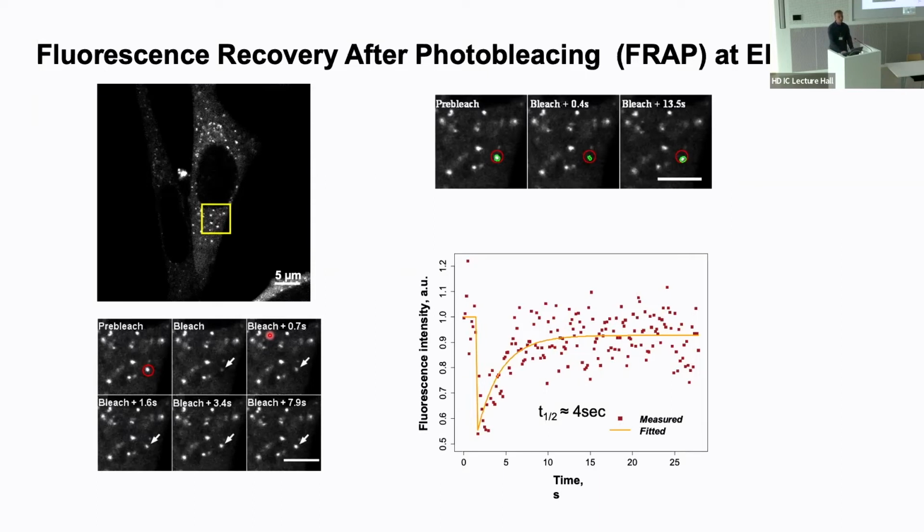The problem with doing it manually, and that's why feedback microscopy is important, is that while I'm configuring all of that, most likely the cell will change or the structure is gone. It's a very repetitive, demanding process, but with little degree of success. So to do this experiment completely automatically, we needed to automate it. But when you automate this workflow, which you otherwise would do manually, you require a couple of decisions, right? You need to find the region, that is number one. You need to define the region, and then you need to trigger the bleaching.